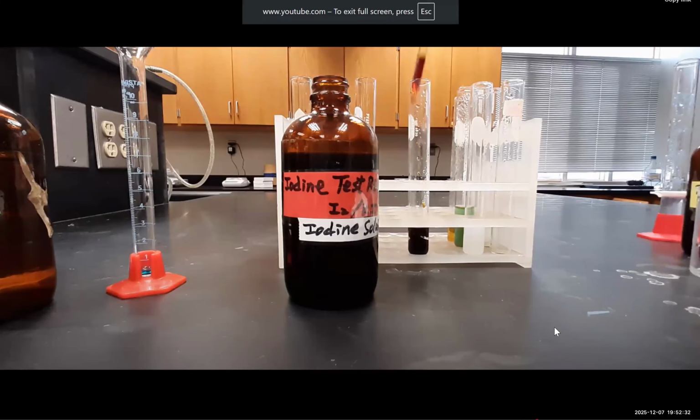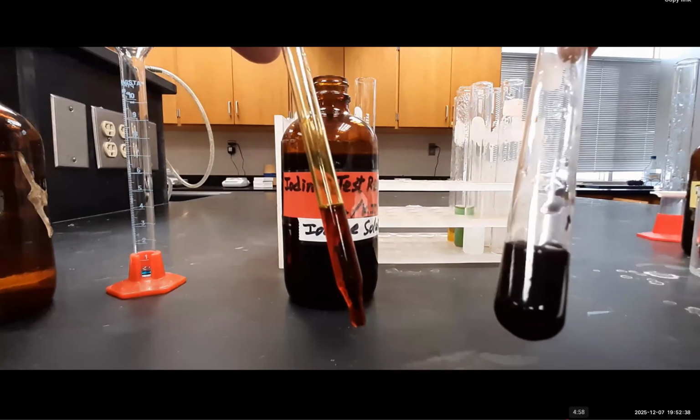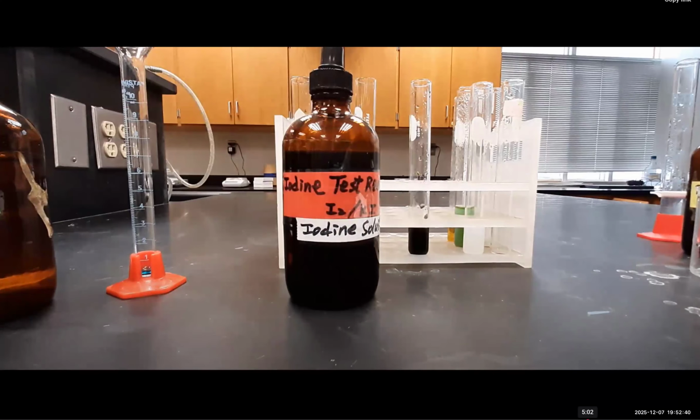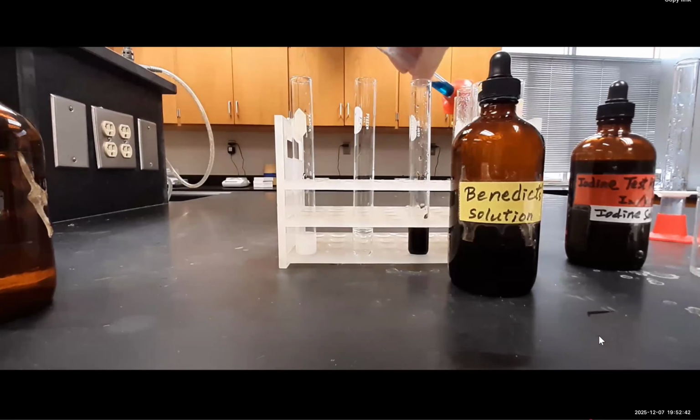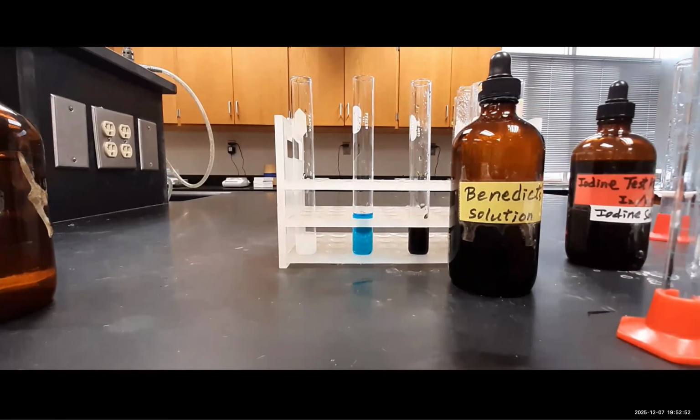Okay, let's take a look at the glucose test now. Here we're going to test our filtrate solution for glucose using Benedict's reagent. So we're going to mix these solutions together and then heat the solution for about 5 to 10 minutes in a boiling water bath.